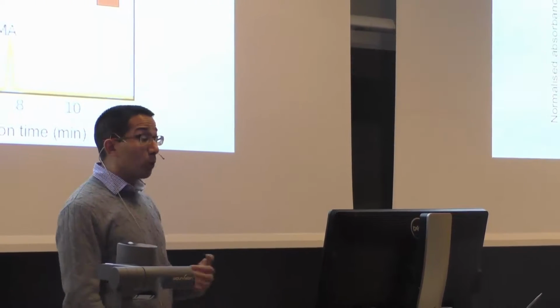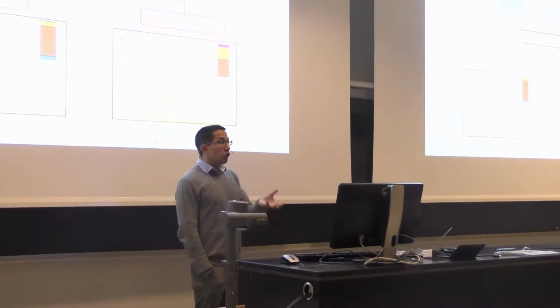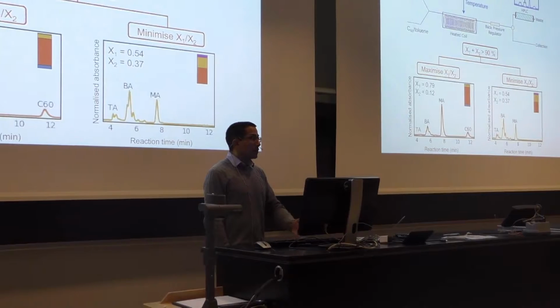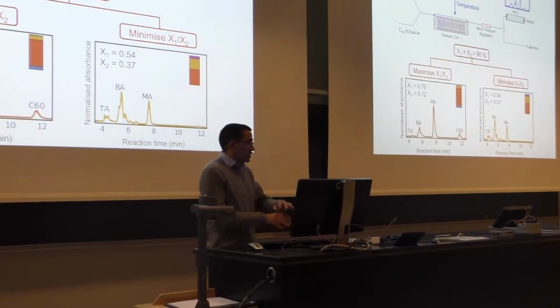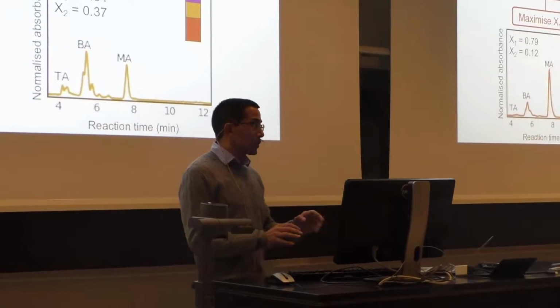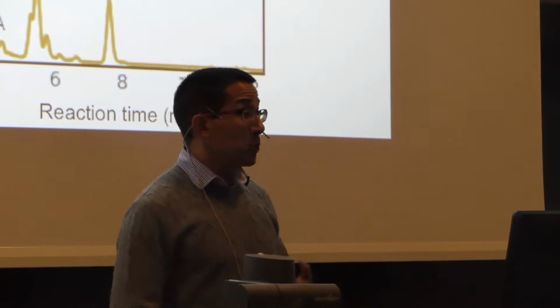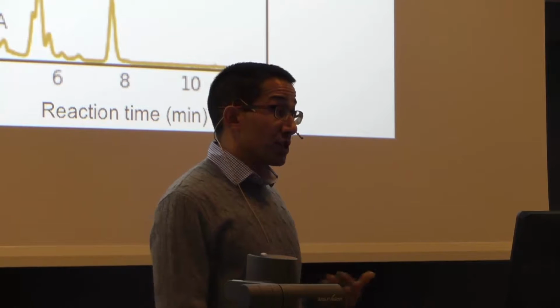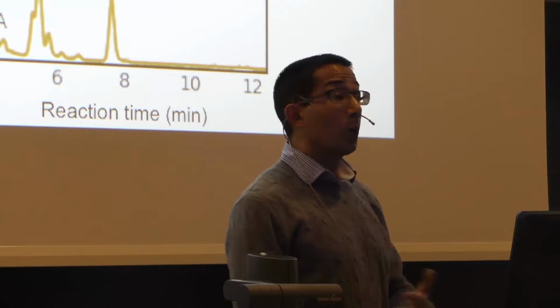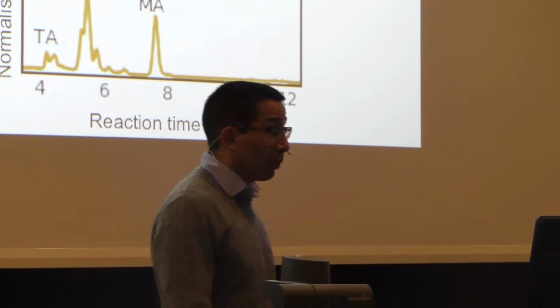And our hope ultimately is we'll begin to be able to discover new material systems or new unexplored reaction conditions that a conventional chemist would not think about looking at because they're so far out of normal experience that they're considered not worth exploring. If you develop tools that can explore spaces extremely quickly, then you have the potential to do, hopefully, new chemistry and discover new materials that just aren't accessible by conventional techniques. So that's where we're hoping this kind of approach will lead, but that's many years off, I suspect, but that's what we're trying to do in my group.